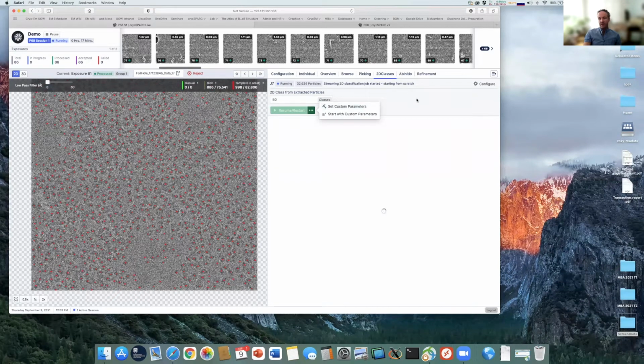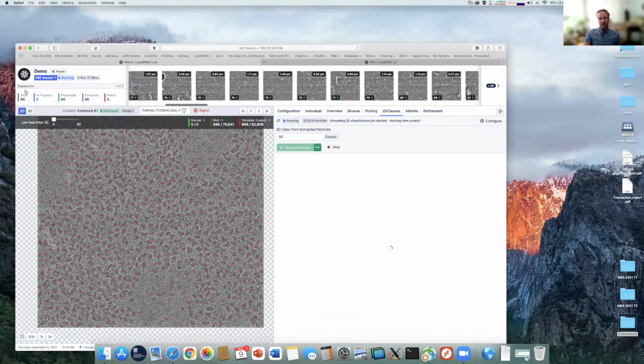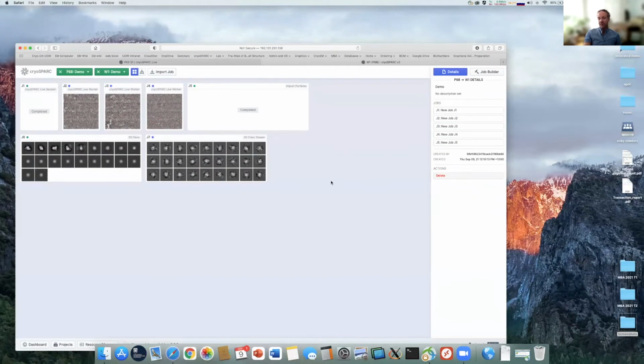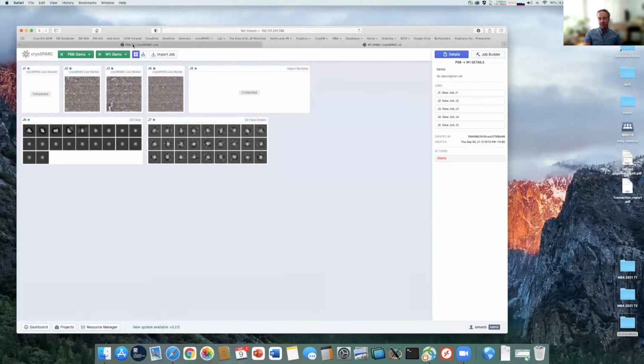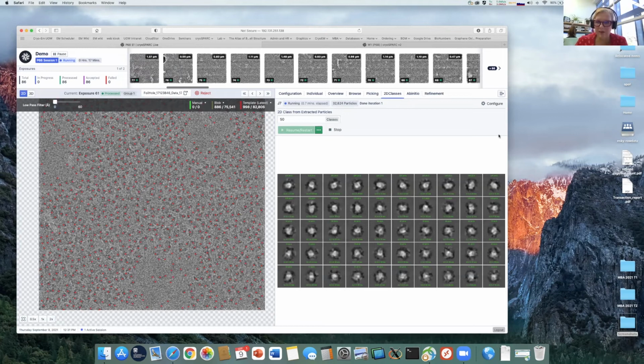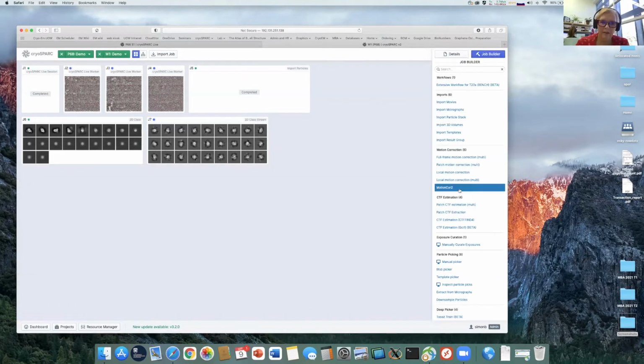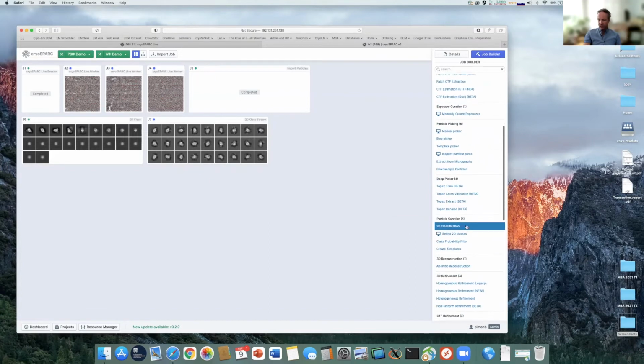What that basically allows you to do is build a job and then go into your normal cryoSPARC instance over here, and it'll create a job that's in a building state, such that you can change all the different advanced parameters, but still use that in cryoSPARC Live. Okay, and what sort of parameters can you play with? Yeah, I'll show you the ones which I quite like to change. I'll just create a 2D job. It's not actually linked to this, but I can show you the parameters.